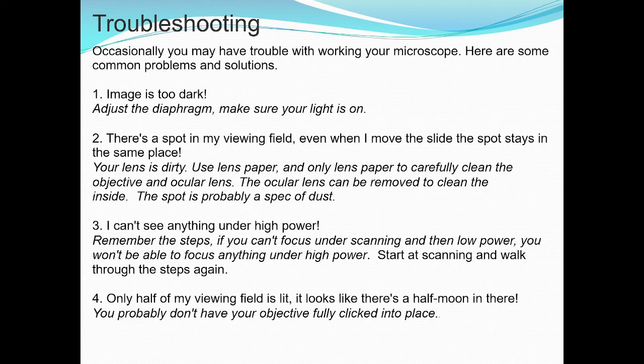Now for troubleshooting tips, here we go. If the image is too dark, just adjust the diaphragm. Make sure your light is on.